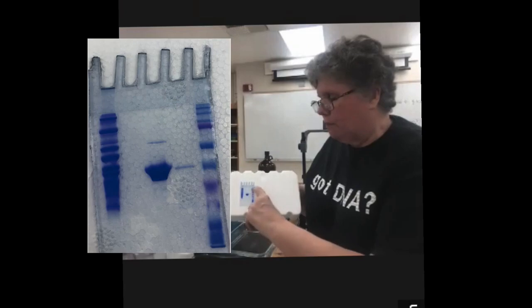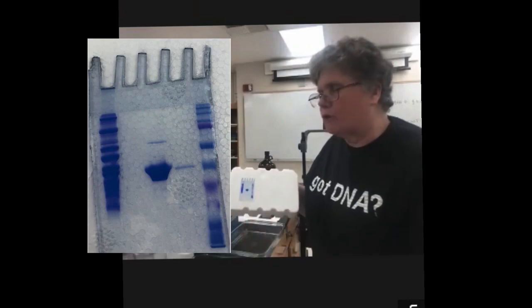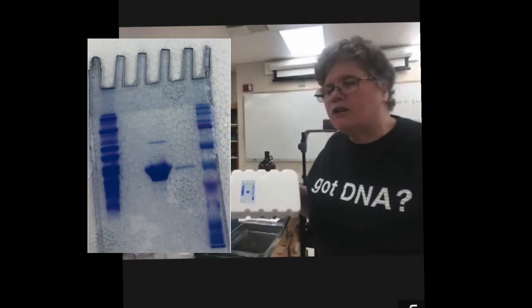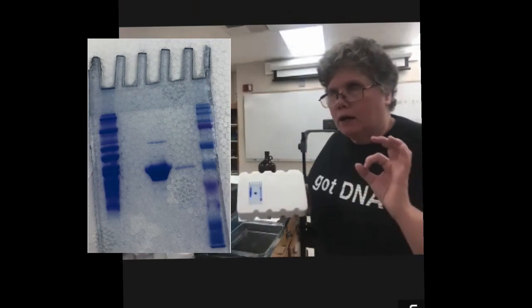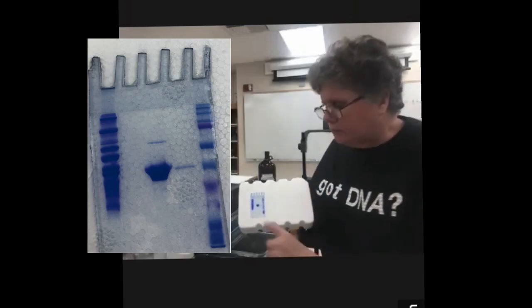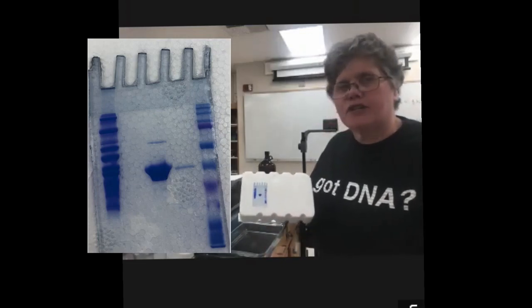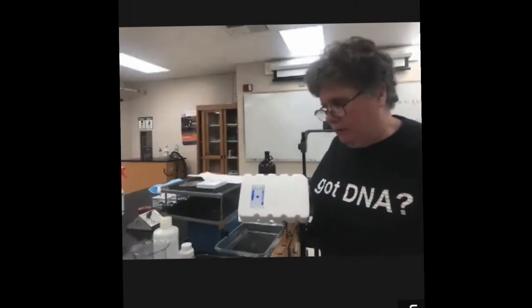And so you can compare these known sizes to the size of your band here, and then you can determine what is the size of our single subunit of aldolase. So remember, from the sizing column, we're getting our native molecular weight of all the subunits. And from our SDS gel, we're getting the size of a single subunit, so that you can then do the calculation for how many subunits.